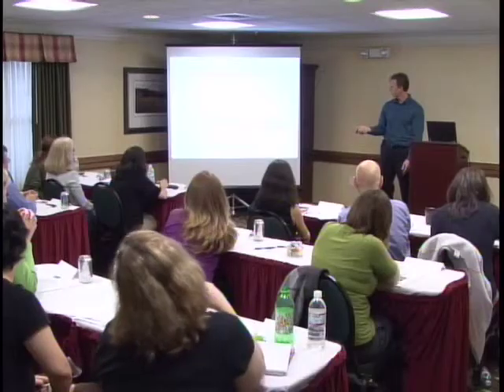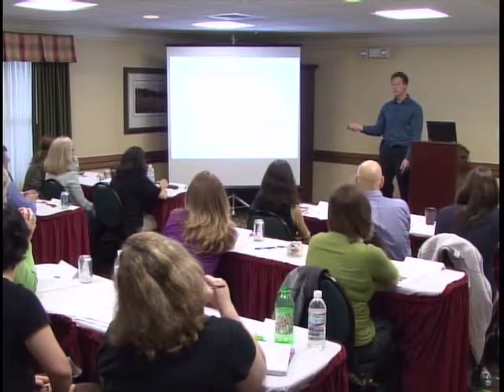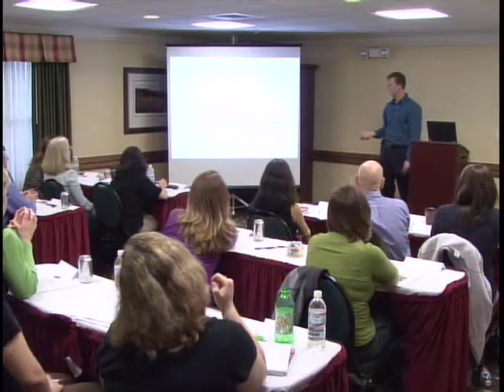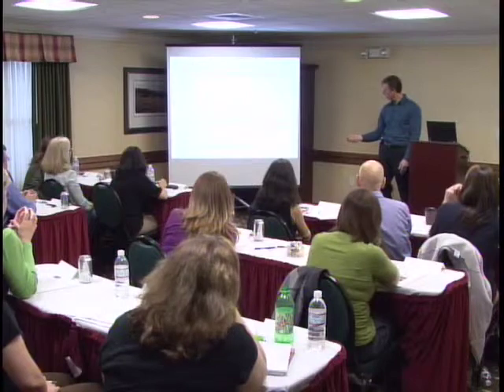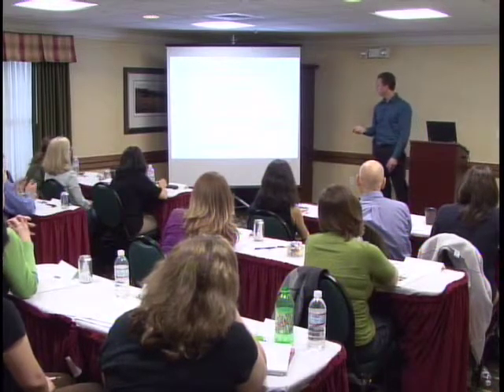This is from another blinded sample. These 2 products, which differ by a C to T transition, are in almost 50-50 abundance. If they weren't, you can still quantify the relative abundance of the 2.